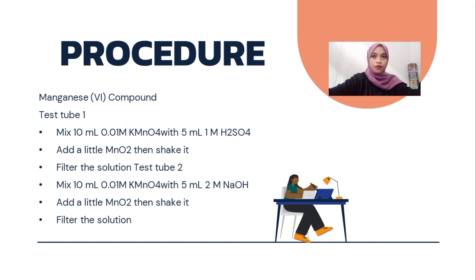Test tube 1. Mix 10 ml 0.01 molar KMnO4 with 5 ml 1 molar H2SO4. Next step, add a little MnO2, then shake it. Next, filter the solution.